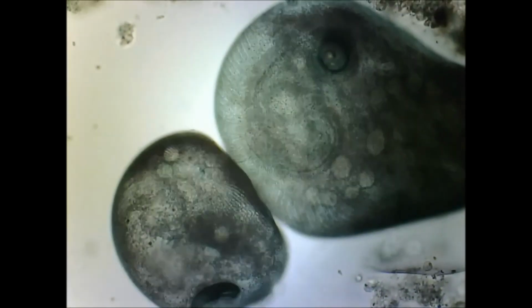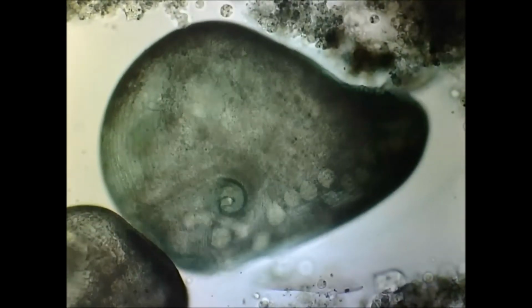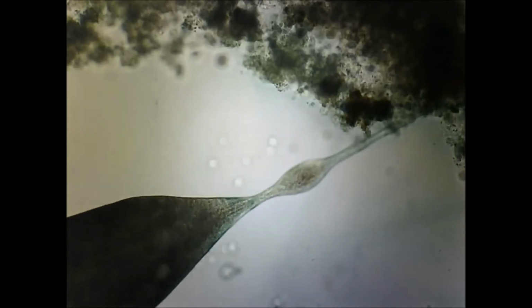Here we see up close now two Stentor, and I'm going to focus on the top one. That dark green circular spot is the buccal funnel. The stripes you can see in the membrane there are myonemes. They're, in essence, like little muscle fibers that allow this to change shape and stretch out or contract, as the case may be. It's one of the fastest contracting cells in the world after Spirostomum, feature of another Microsafari.